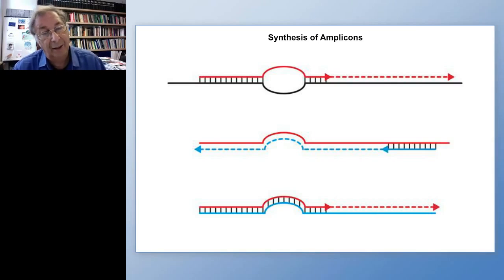But here's the neat thing. When the conventional reverse primer copies the amplicon made, copies the amplicon that includes the whole sequence of the super-selective primer, then the amplicon made in dotted blue lines there is a perfect copy of the entire super-selective primer sequence. So now if you go down to the diagram at the bottom of this figure, which is now the third cycle of amplification, you see that the super-selective primer now is completely complementary to that blue amplicon.